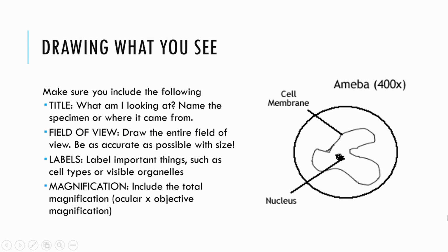Also, make sure to include labels. Label things that are important or that you're instructed to label.